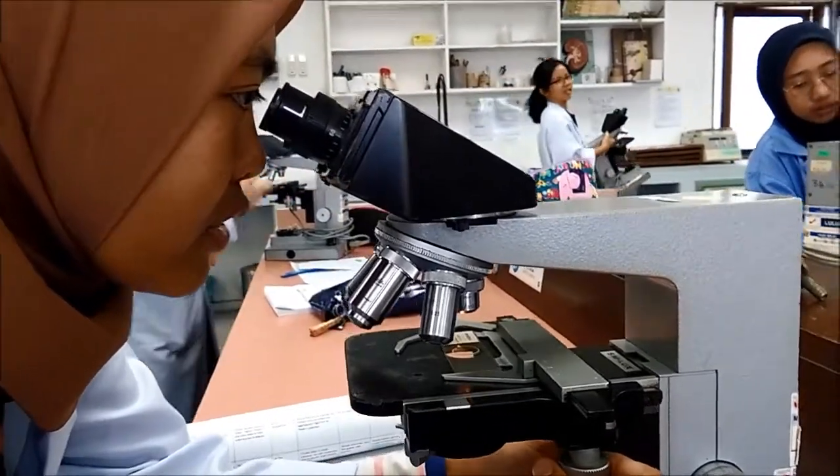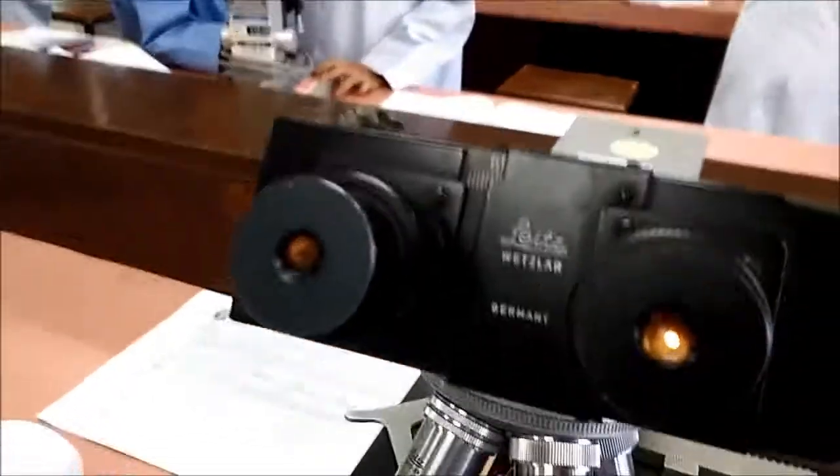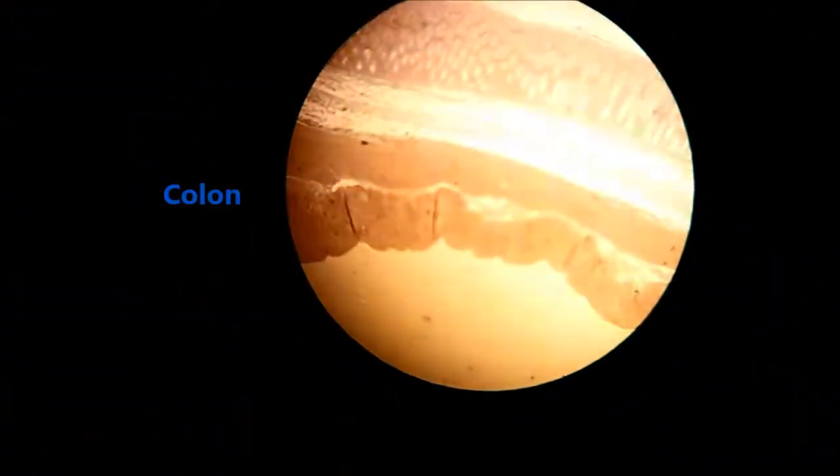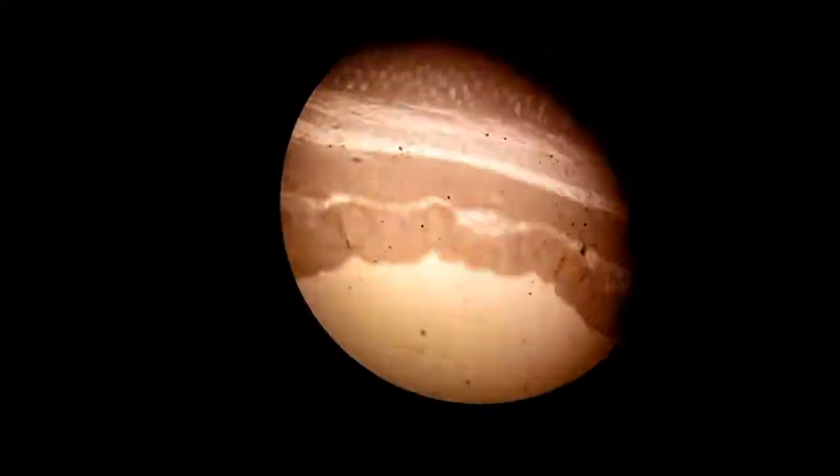Now we have found it, and let me see. Ta-da! That's it. Okay.